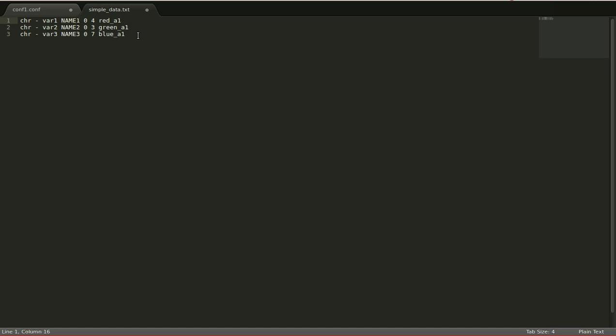Later we can change it, but for example I'm going to make this underscore over here to reflect the change. Then we have these two numbers. These two numbers represent the length of these nodes or karyotype. For this case I'm telling that this node has a length of 4. It has 4 parts, from 0 to 1, 1 to 2, 2 to 3, 3 to 4, and for the last part we specify the color.